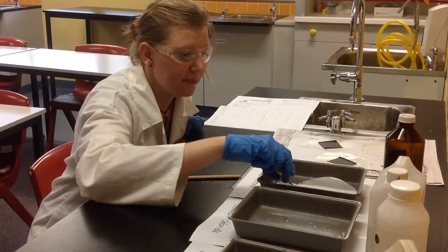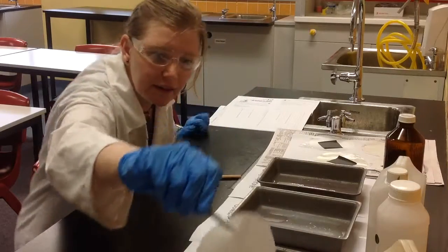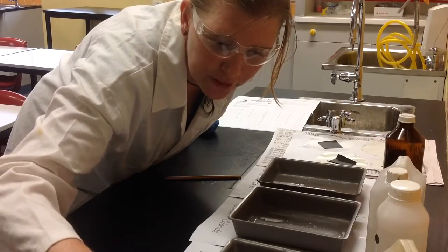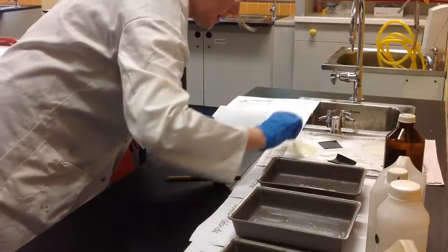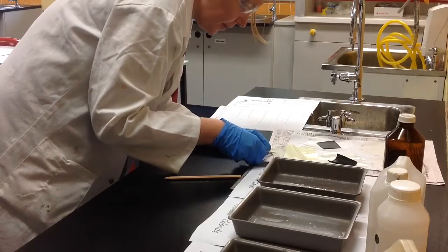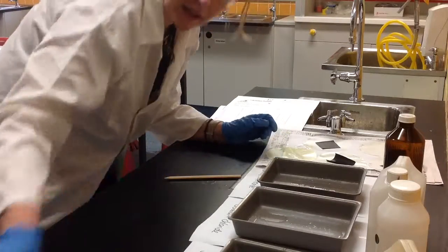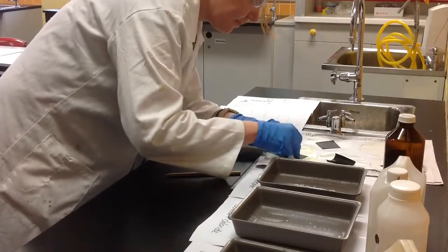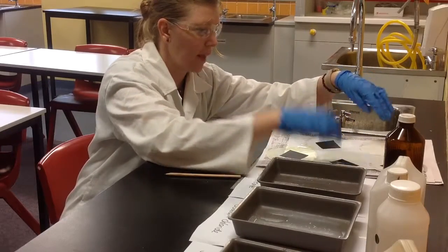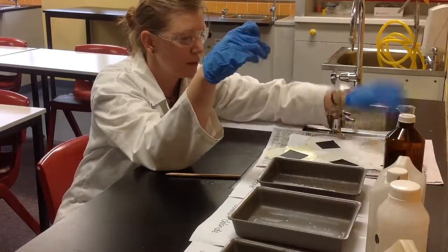And then lastly, we do our silver iodide — much more of a yellow compound there. Put it on our paper. There we go, the last bit of card. So now all we have to do is wait and see what is going to happen to our pieces of paper. I also have a silver nitrate one not covered as a control — you can actually see if nothing's covered, what you're expecting to see on the paper.